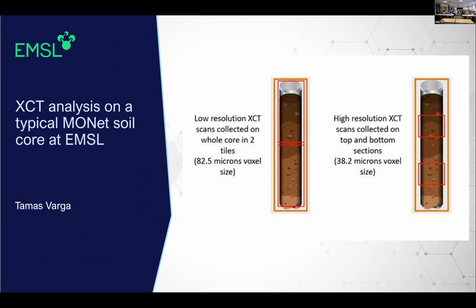So micro CT for MONet will be through our collaboration with APS, with the synchrotron. Will they be able to look at the pores and check whether there's organic matter there or not, or how far it is from the? Yes. At least at the synchrotron, you can play with the X-ray energy.